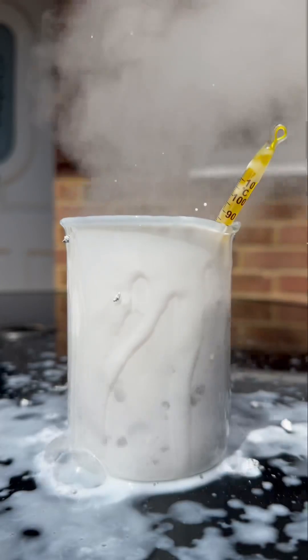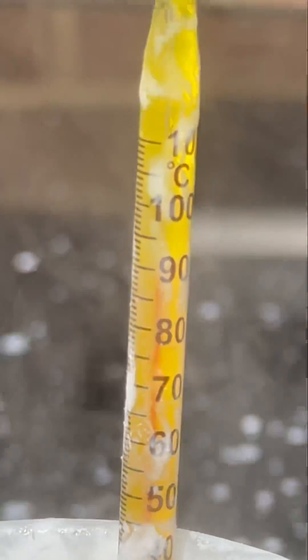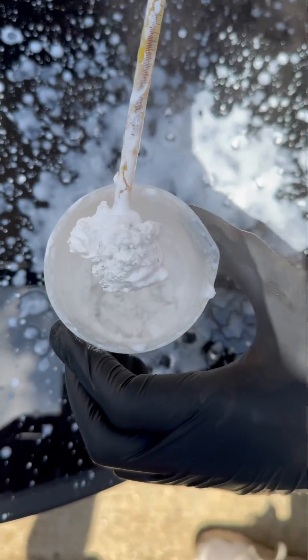So that's hydrogen gas. Look at the temperature - 100 degrees bruv. Bare hot in that. So all that white stuff, that's calcium hydroxide. That's an alkaline thing like sodium hydroxide and potassium hydroxide.